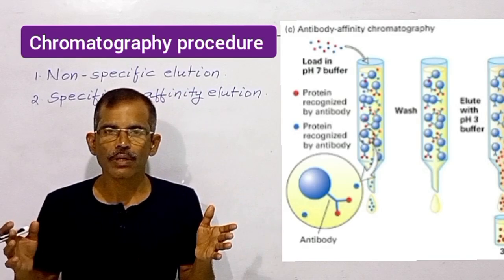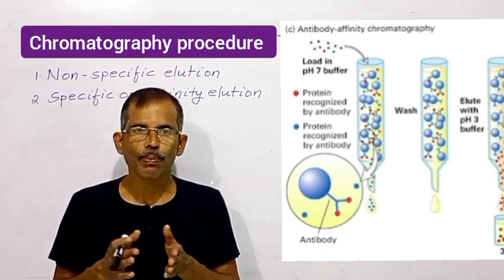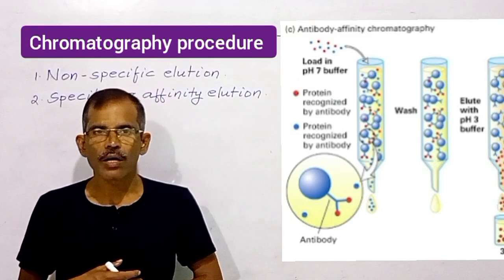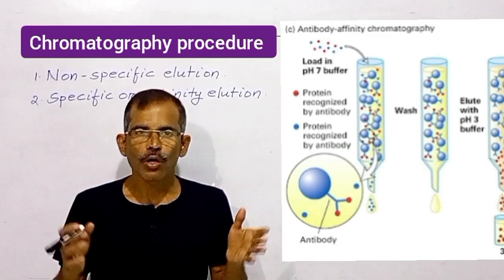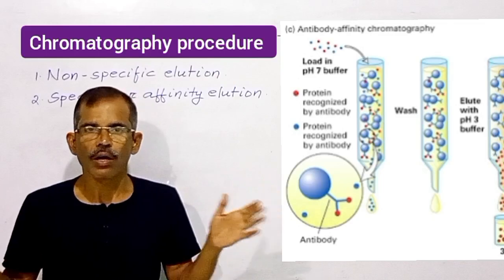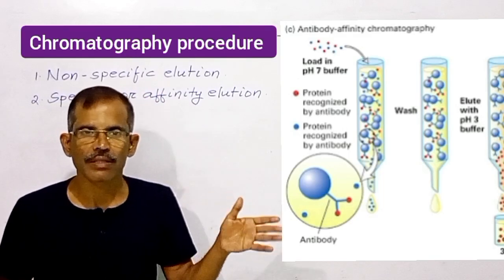ligand macromolecule interaction. The sample is applied at the top of the column and then the buffer is passed through it. After binding of the macromolecules with their characteristic ligands, the column is eluted using more buffer in order to remove non-specifically bound unwanted molecules. After all unwanted molecules have been flushed out of the column, macromolecules that are bound to their characteristic ligand are eluted by two separate methods.